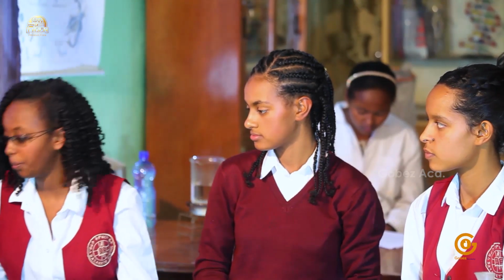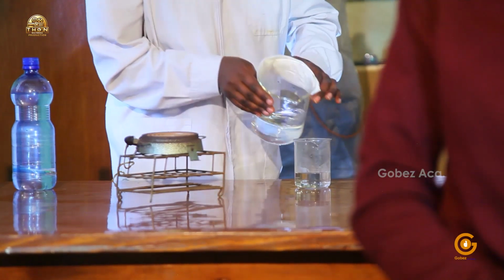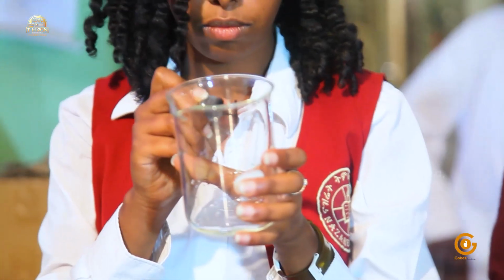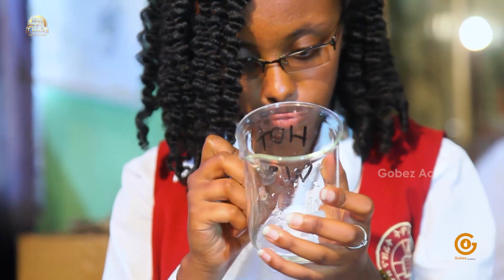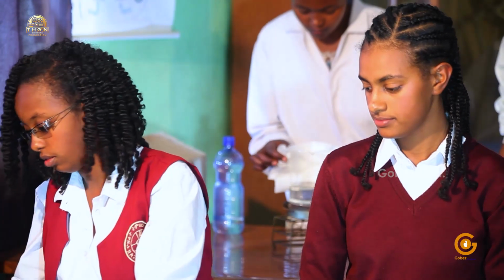For the third part of this experiment, we require boiling water. On the third beaker, I write hot water. And carefully pour into it boiling water.